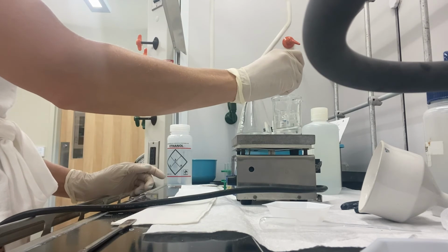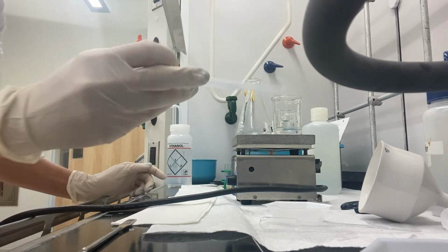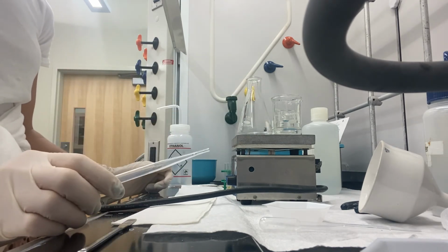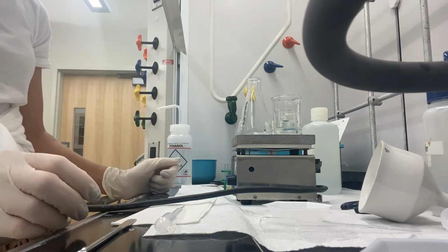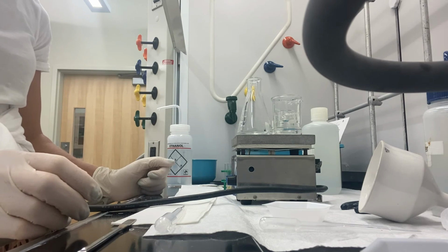Okay, I'm going to let that heat up. You can see there's some crystals that have not dissolved. We're going to let that heat, and then I'm going to add, I believe it's an equal amount of water to this solution. You're starting to see bubbles.